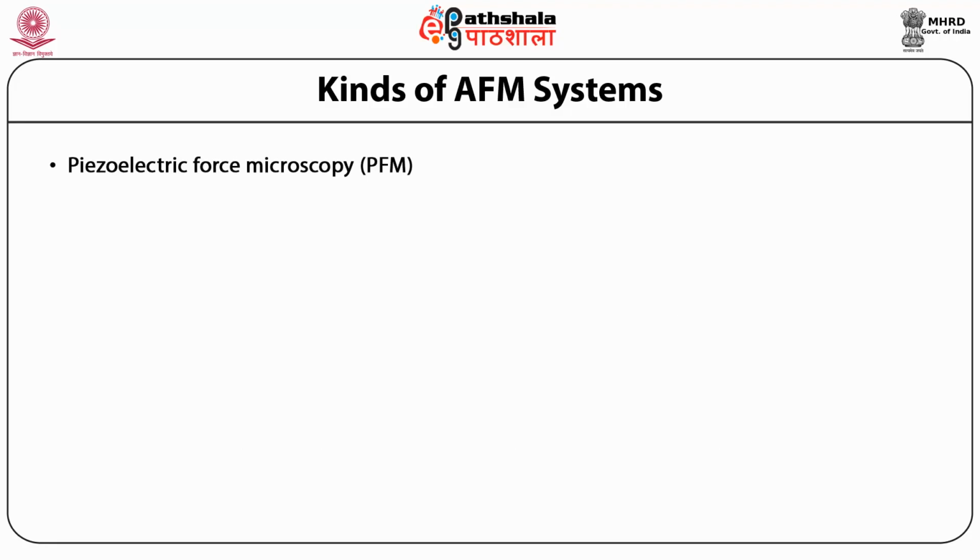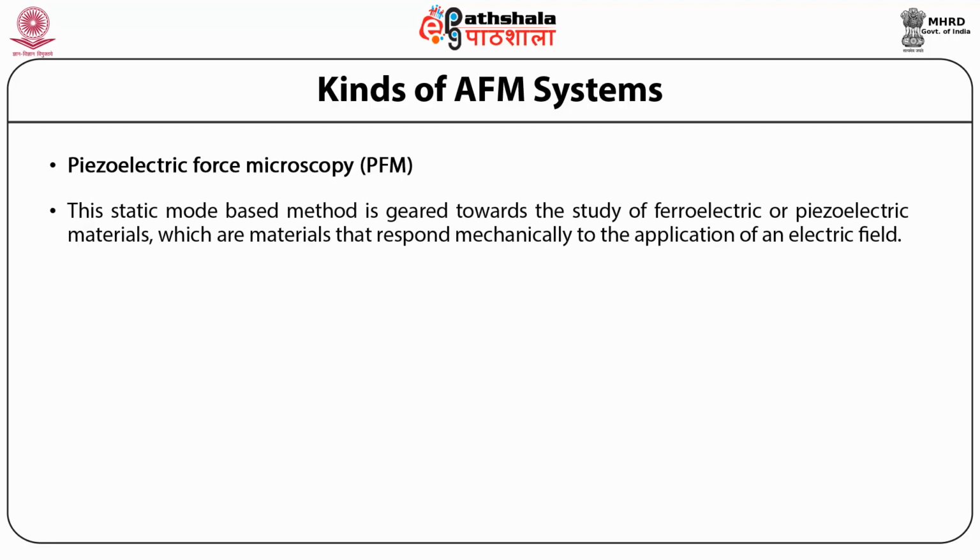Then the piezoelectric force microscopy, generally termed as PFM. This static mode based method is geared towards the study of ferroelectric or piezoelectric materials, which are materials that respond mechanically to the application of an electric field. This mode measures topography simultaneously with the mechanical response of the material when an electric voltage is applied with a conductive AFM tip.